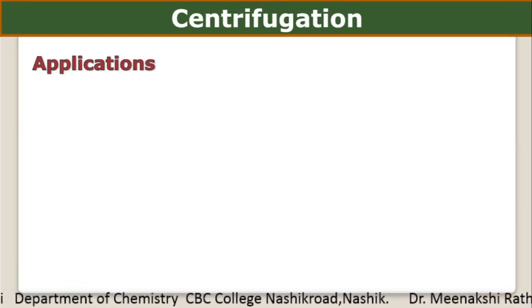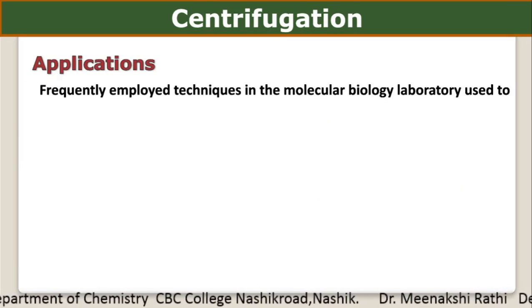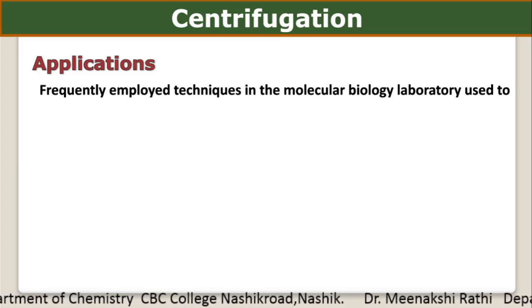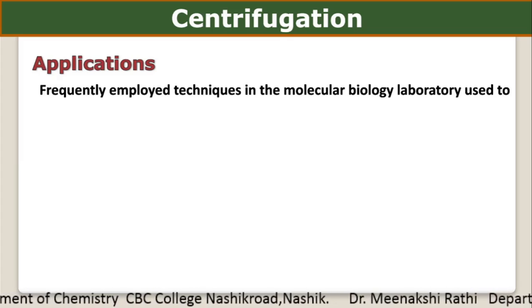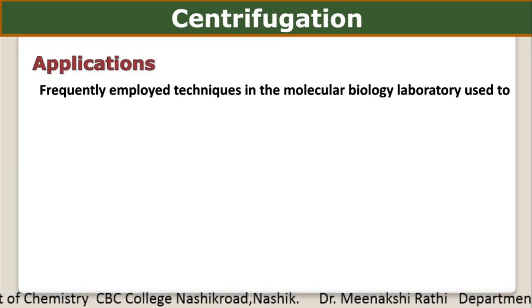Centrifugation has a number of applications, and it is a frequently employed technique in the molecular biology laboratory.